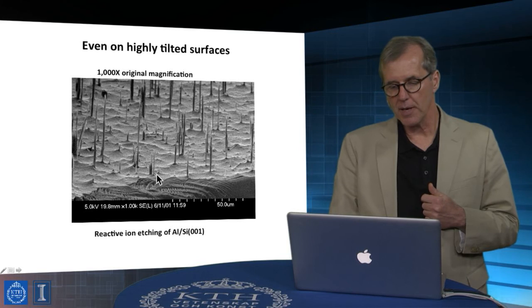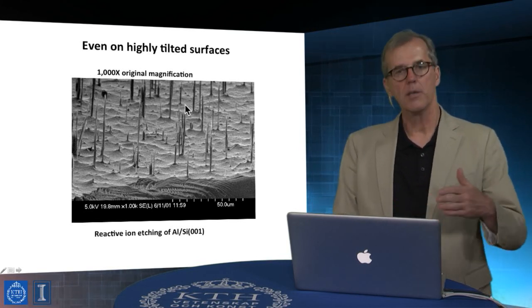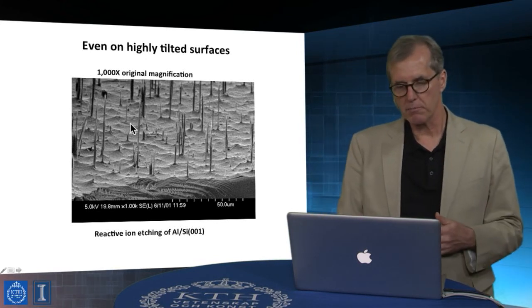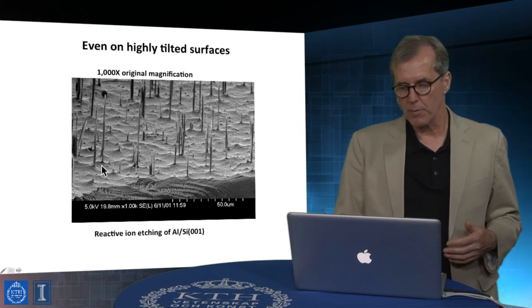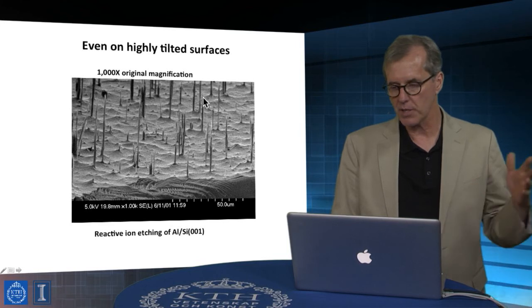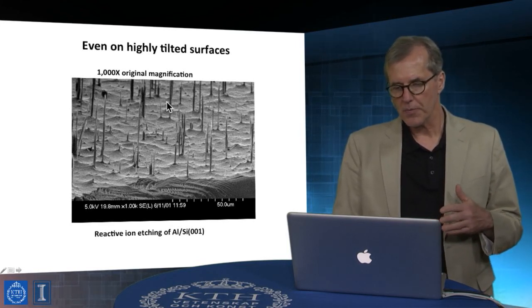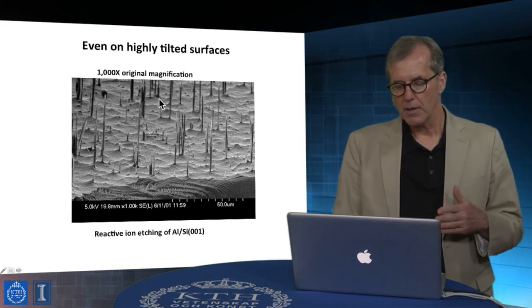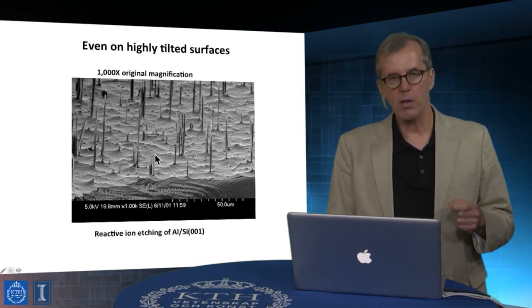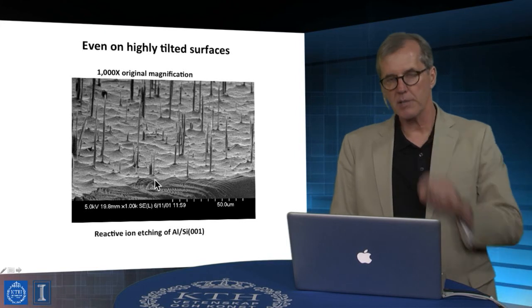And one of the things you'll notice is that it kind of looks like a forest after a fire, these burnt stalks of former trees standing there on a desolate plain, all the branches and leaves burned off. But actually what these are are very thin spiculate architectures that come from the fact that very small aluminum clusters in regions protected this material against etching.